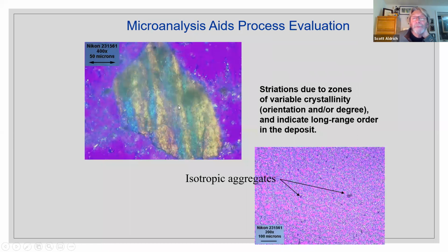Here's another example of, or really two examples of, let's say, striations in a material that's been machined so that the particles are very small, but now this mass of particles, they've clumped together, and they've clumped together in various zones and created a rather suboptimal outcome.